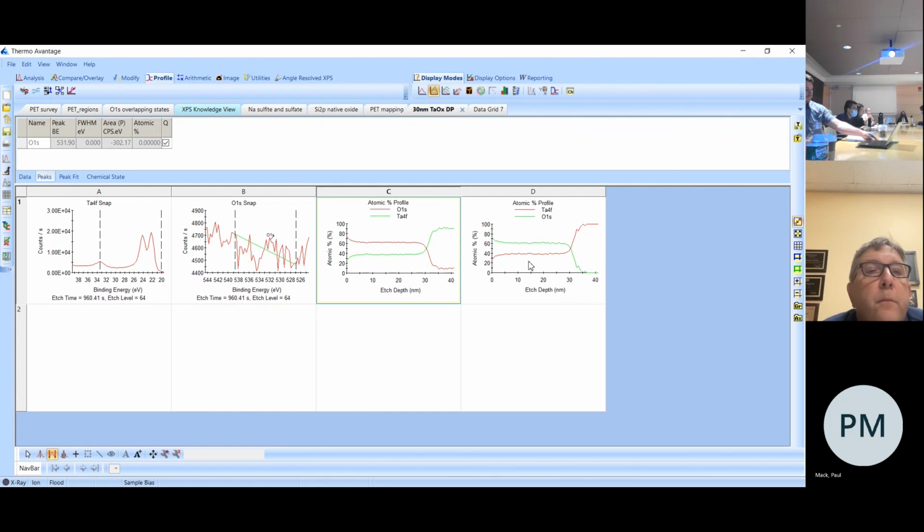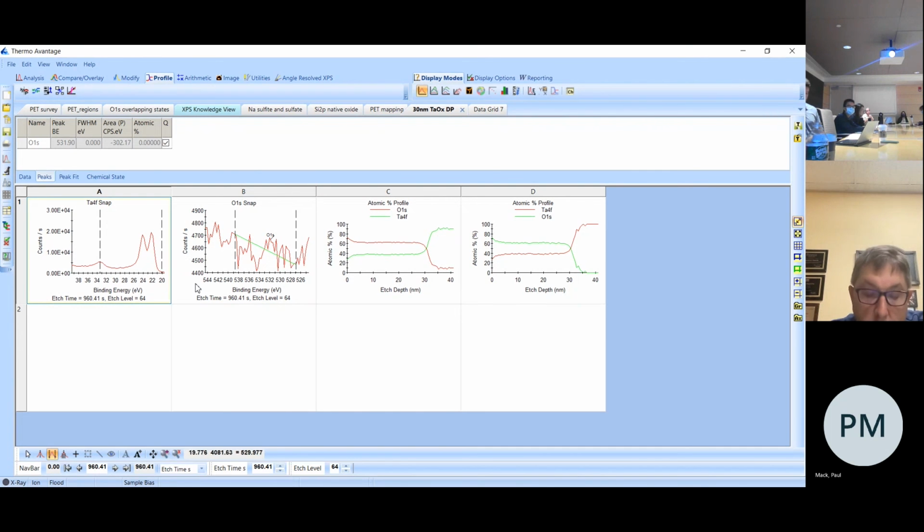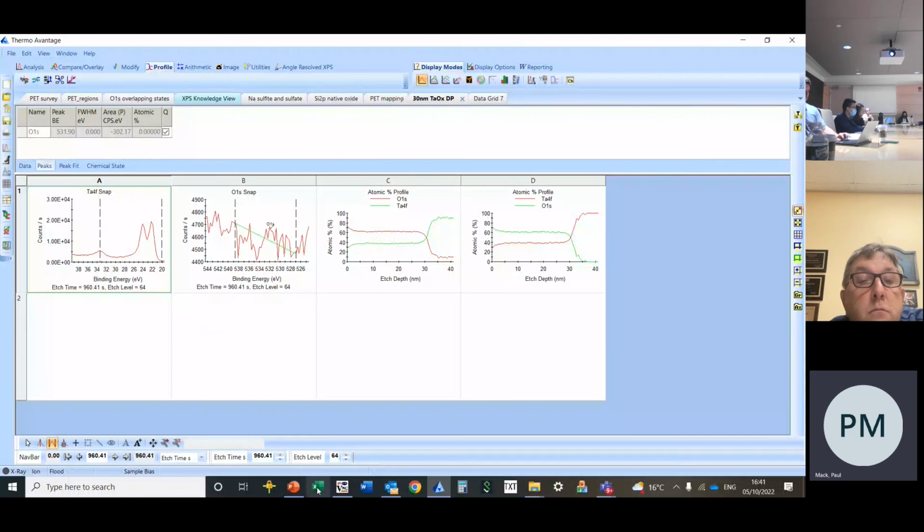Go ahead. The data tables, is there a quick and easy way to download all of those? Like say you generated a batch and you have a lot of data, or do you have to go to every individual one? She's asking the best way to export multiple plots, like you have on the screen here. Let me show you quickly again. So if you open up Excel, for example.